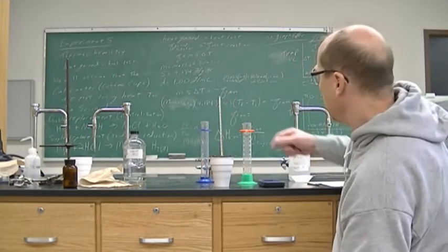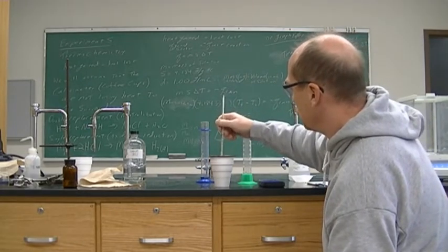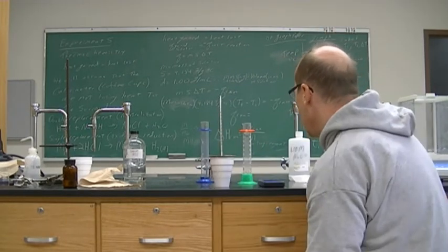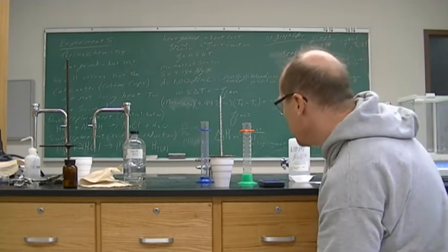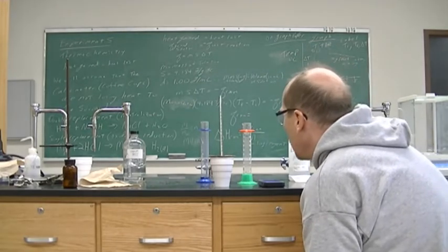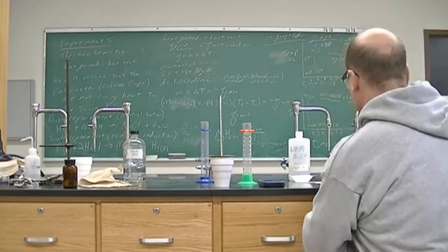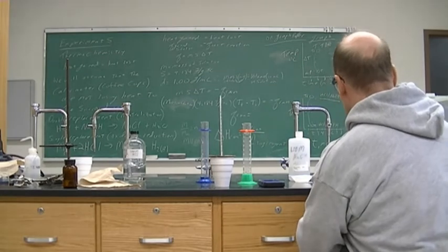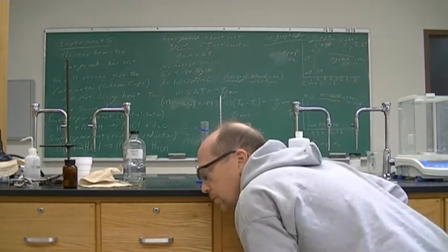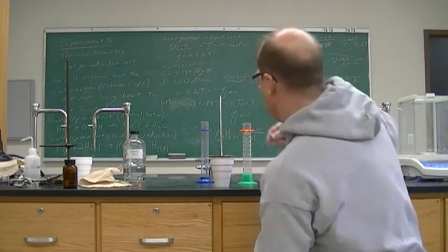It is still bubbling. All right, at the 6-minute mark, we are at 34.0 degrees Celsius. I still hear a little bit of bubbling. It's still reacting.